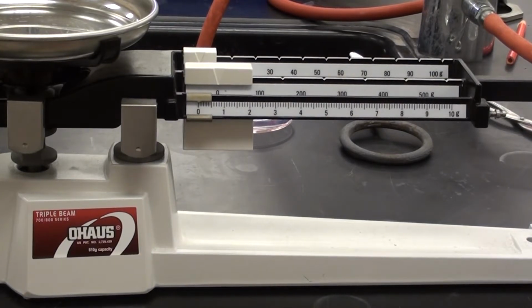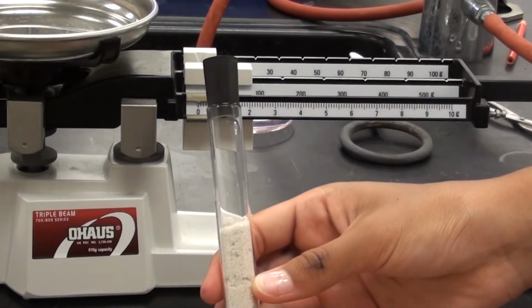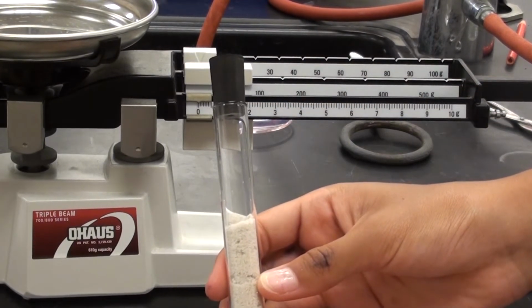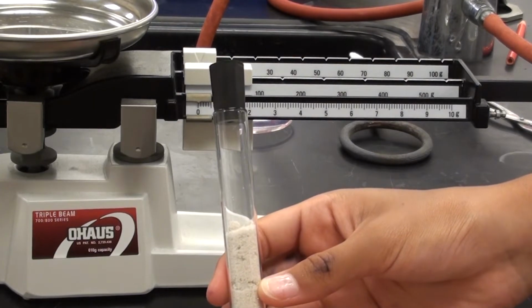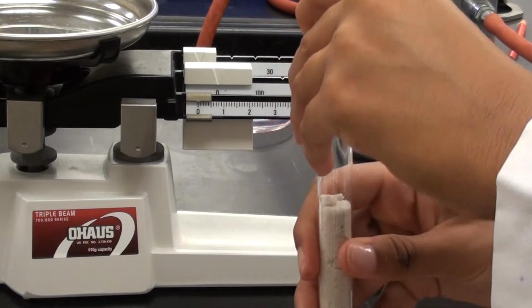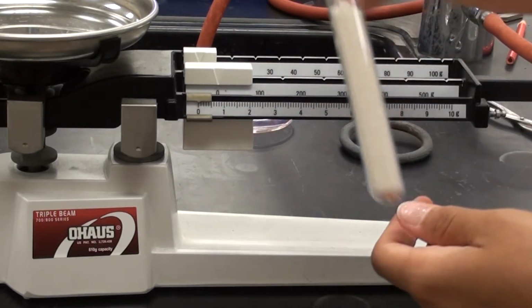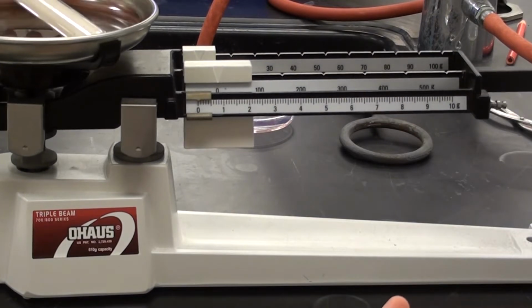So this is the separation of binary mixtures lab. Sabrine has a sample. Show the camera, Sabrine. A little bit down. There we go. You can see it's got a stopper on it. We need to be a little bit careful about how we weigh this. We're going to be consistent and weigh it without the stopper. Would you please take the stopper off, Sabrine? Thank you. Go ahead now and weigh the test tube and the sand.